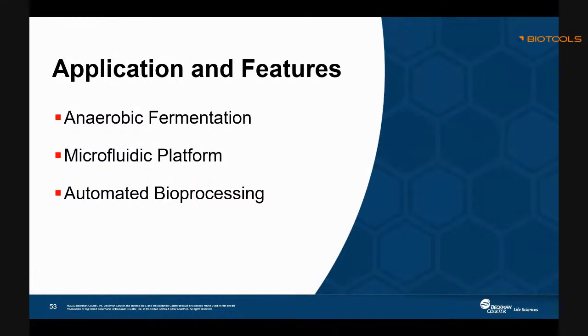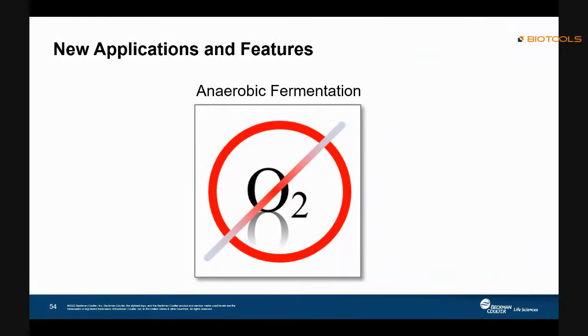And we talk about how we can do anaerobic fermentation. Just like the name, this is very easy to understand. This is talking about doing something without oxygen.